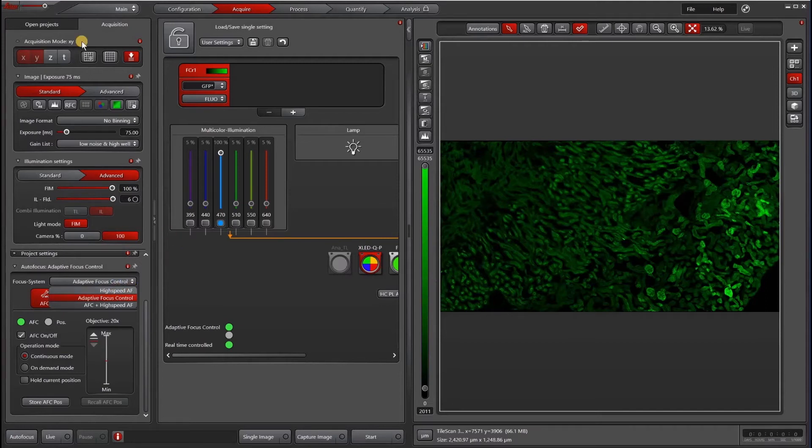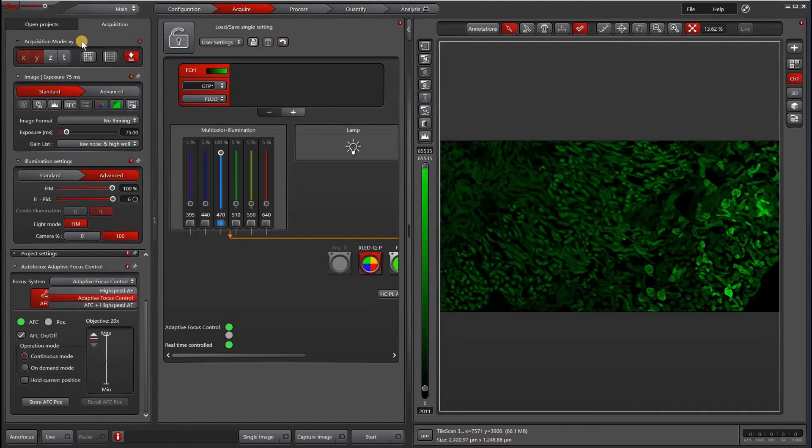Another tip with AFC is that your sample should be pretty close to the cover slip and relatively flat. If you have something that may be embedded in Matrigel or something that's a little bit further away from the cover slip or with variable focus, then AFC may not work for you.